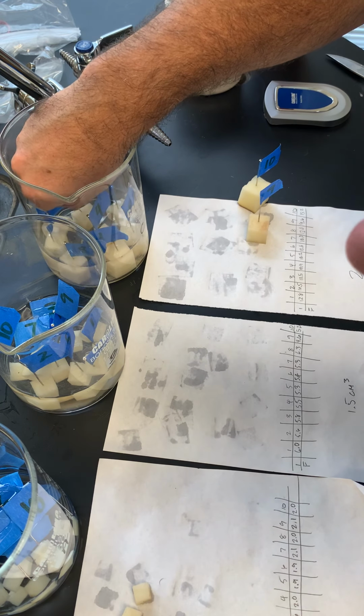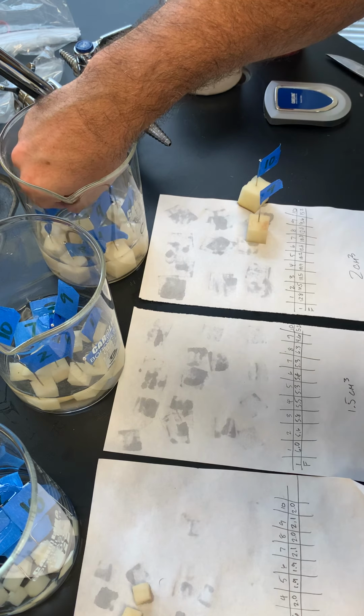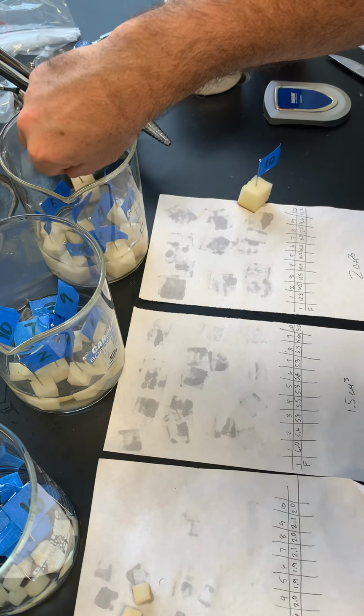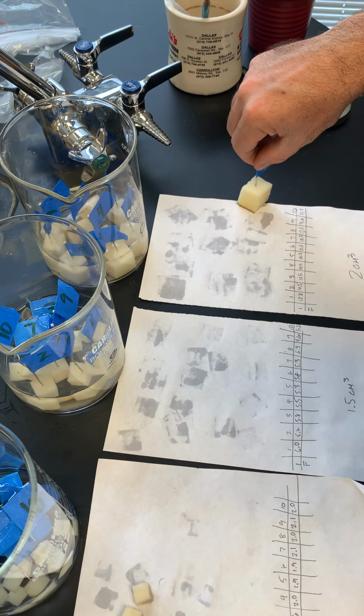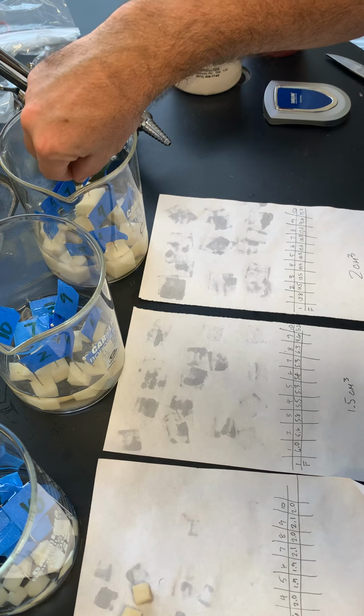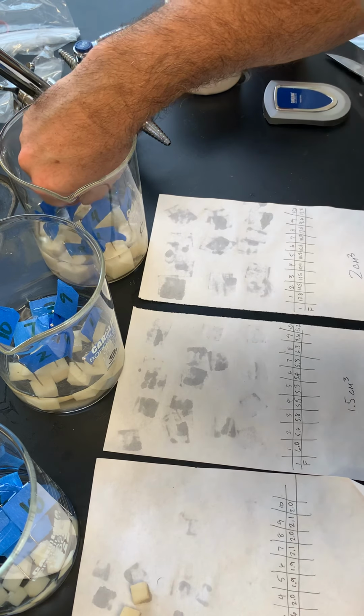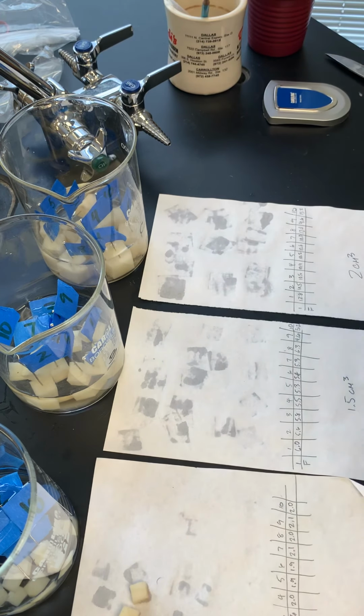Whoa, don't get away from me, buddy. Woo! I'm increasing the surface area of that one because I stabbed another hole in it. So, see if I can get this one to be completely submerged. Come on. There we go. Okay, they all fit.